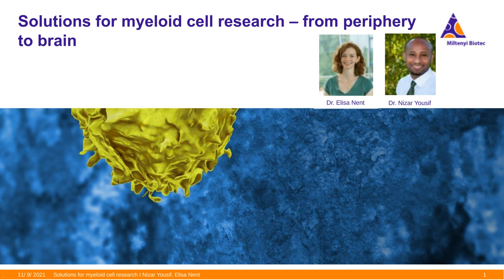Any solution for microglia cell counts? Do you have any solution for that? Thanks for the question. I'm not 100% sure what is meant, so maybe you can elaborate a bit on this question. But basically, if you use the CD11b beads for the isolation of microglia, you get quite high numbers.